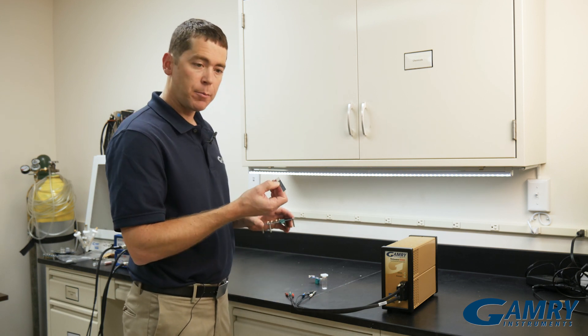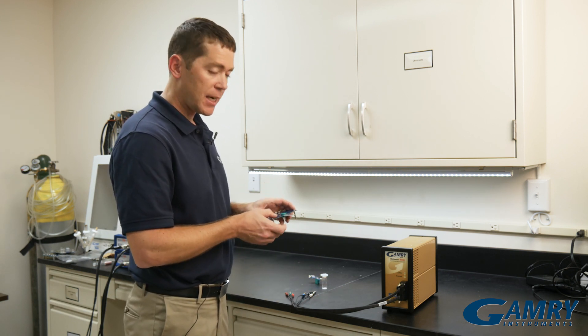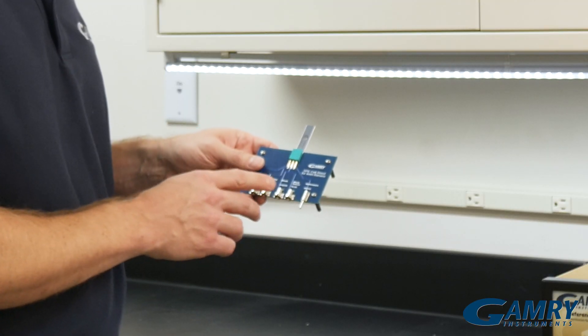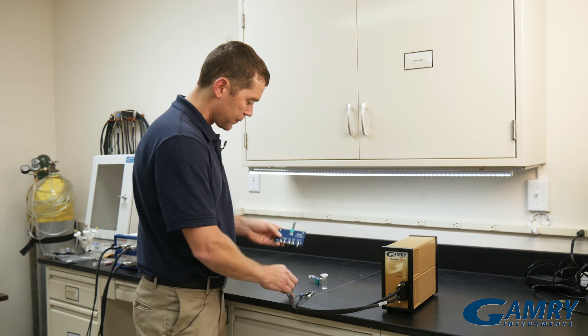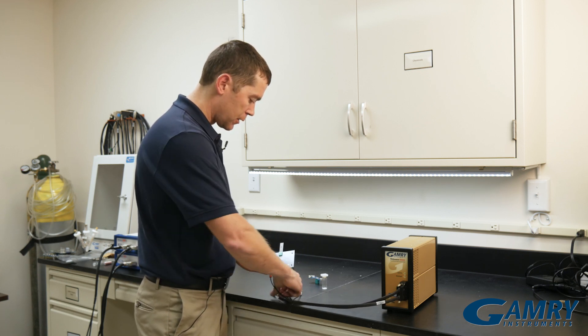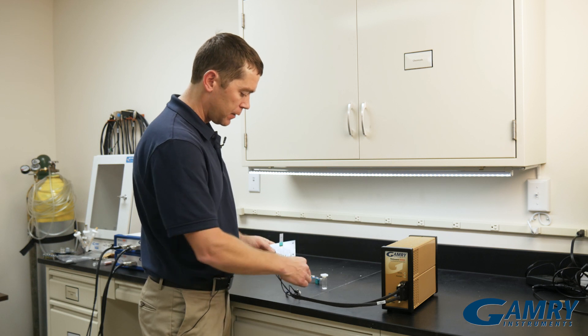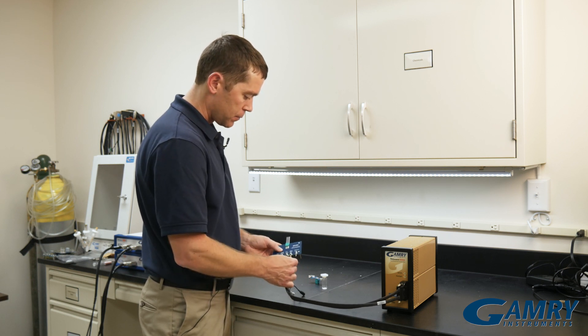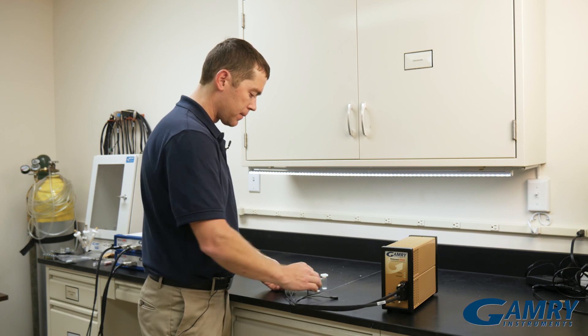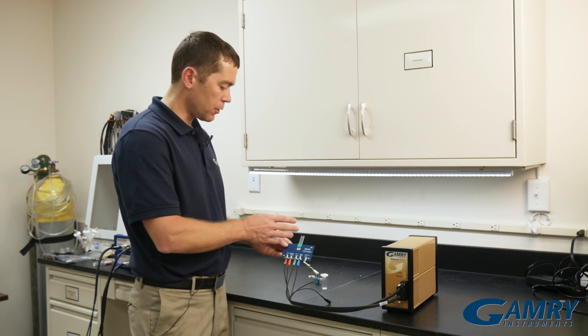We simply take our screen printed electrode, slide it into our stand, and then we make connections to our screen printed electrode holder based on what the colors say: red, orange, green, blue, and white. And so now we've made connections to our screen printed electrode holder.